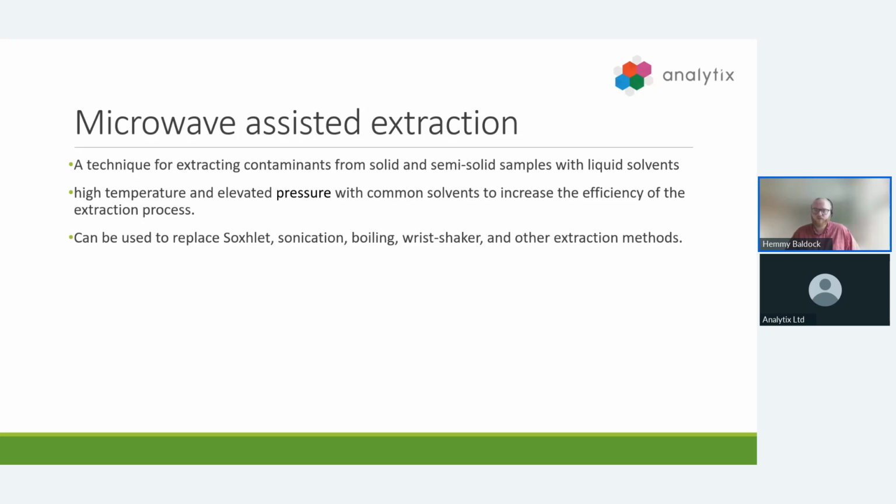Microwave-assisted extraction uses closed vessel systems where high temperatures and elevated pressures with a common solvent can increase the efficiency of the extraction process. This offers faster extraction times while producing more accurate and precise results compared to other sample prep methods. Microwave-assisted extraction can be used to replace Soxhlet, sonication, boiling, or wrist shaker techniques, to name a few.